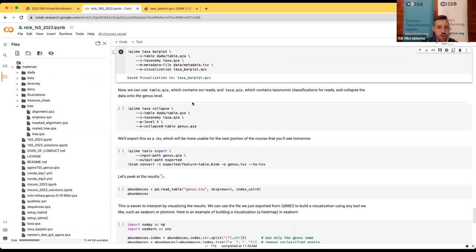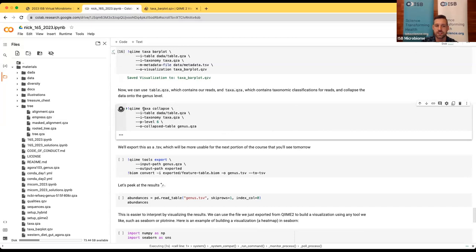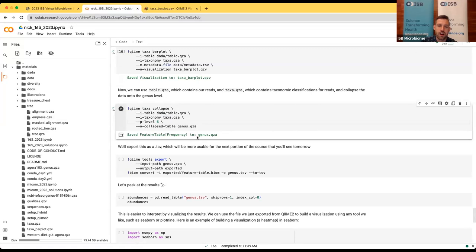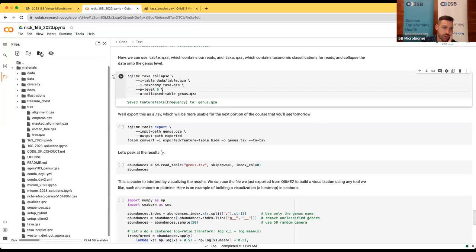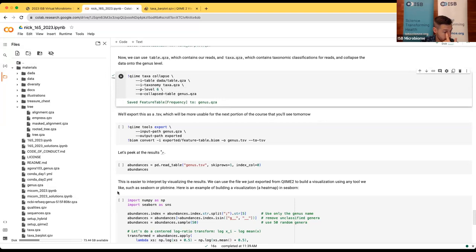Let's switch back to the notebook. Now that we have taxonomic assignments and ASV abundances, we can collapse them together at the genus level to build a table with the abundance of each assigned taxon for each sample. We'll use the taxa plugin's collapse functionality, taking our abundance table and taxonomic assignments and collapsing to the sixth taxonomic level — the genus level. This will save a new QIIME artifact called genus.qza.